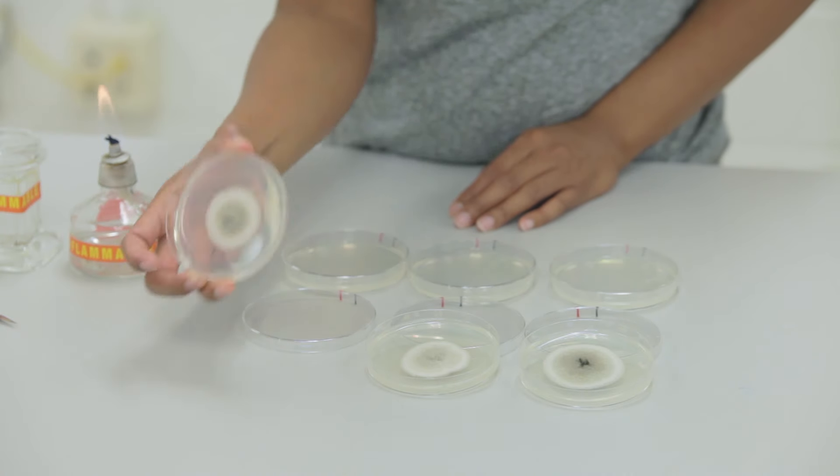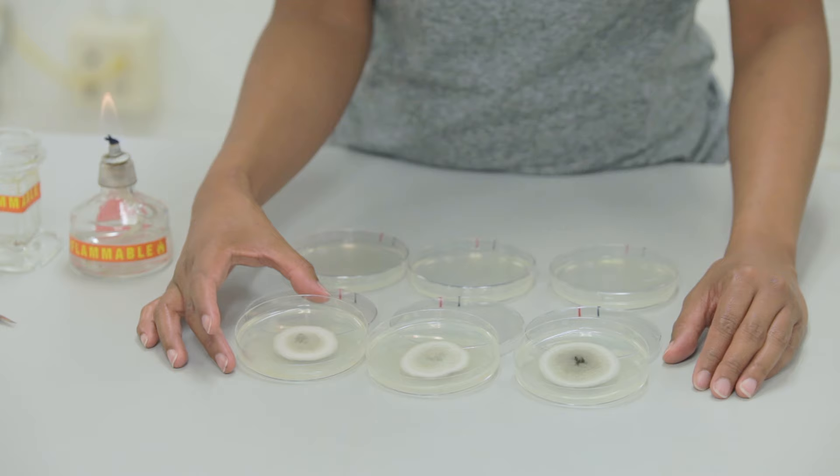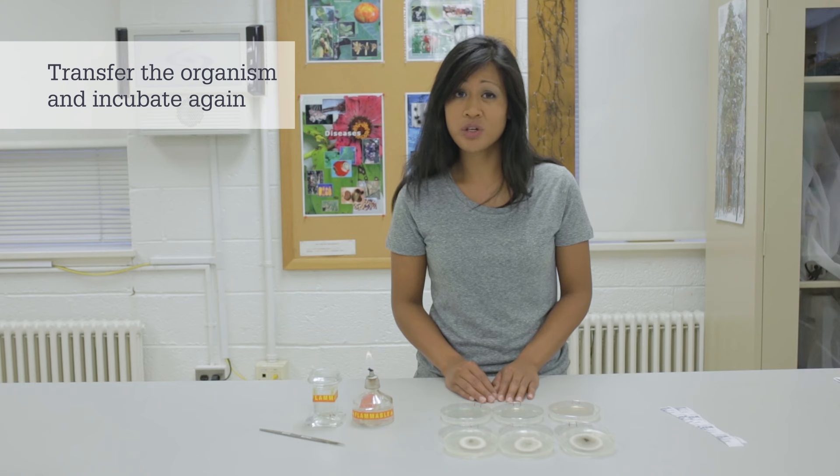After a week, this is the growth that we see on our plates. You'll notice that all three of our isolations have grown out and are similar in appearance. The next step is to transfer the organism to a new plate of medium so that we ensure a pure culture.